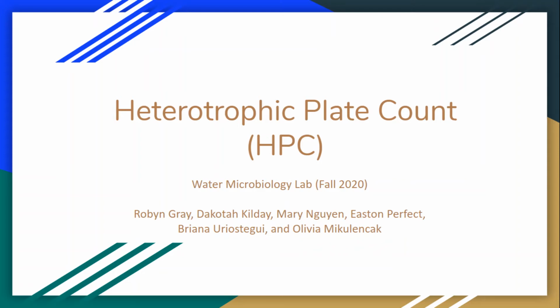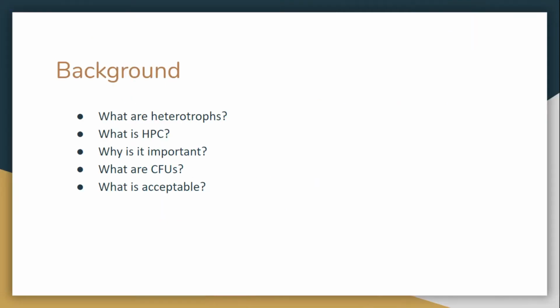Hello everyone. Our lab group was assigned the heterotrophic plate count procedure for this water microbiology lab experiment. To understand the results of this procedure, some background information must be taken into account. First off, what even are heterotrophs?